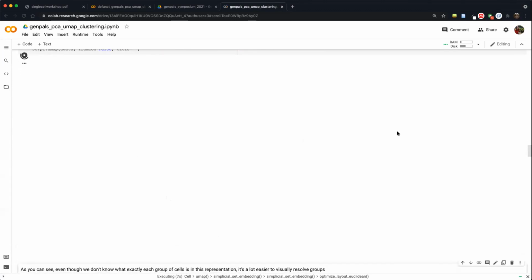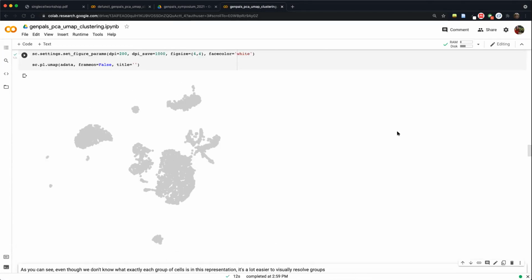Is anybody actually running this on their computer and able to get it to work? Yeah? No? Are you having trouble? No, not your UCI. You need to click the link and then log in as your UCI account. Yeah, sorry. And for people with like 4 Gmail accounts like me, I have to be specific about which one I pick. Okay, so actually, if you want to go around and help, that'd be useful.